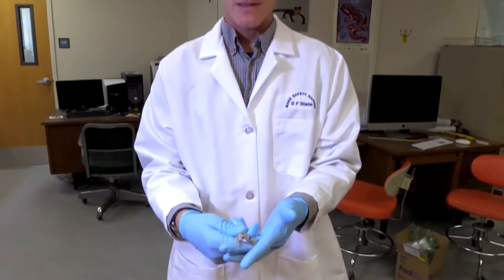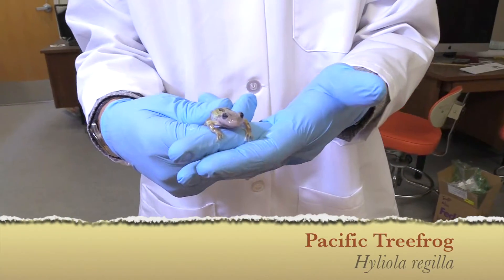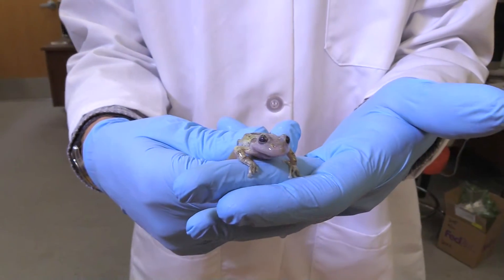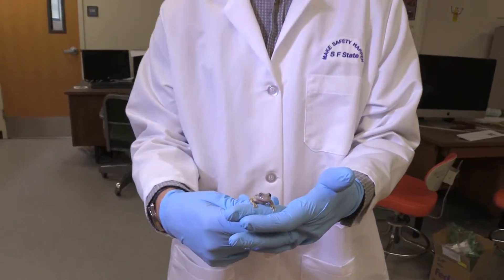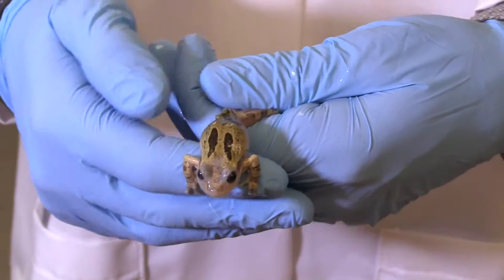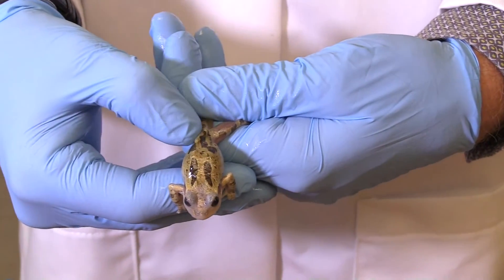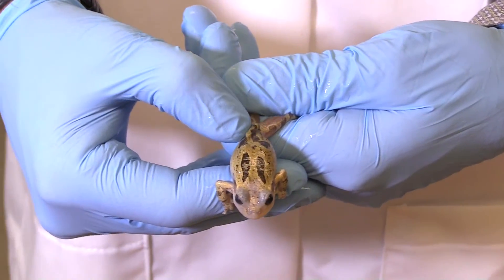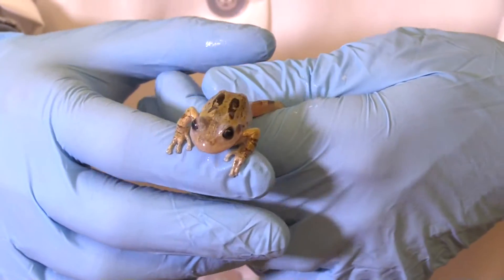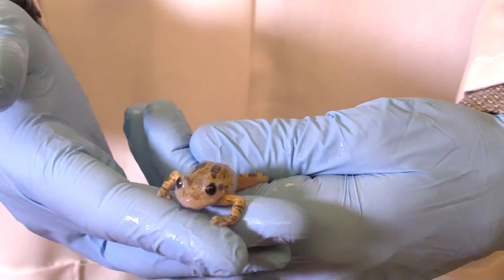I'm going to collect a chytrid swab from this frog right here. This is Hyliola regilla, the Pacific chorus frog or Pacific tree frog. It's very common here in California and is one of the species that is mostly resistant to the chytrid fungus, which has been devastating to amphibians around the world. This guy has a pit tag, which is a microchip — it's about the size of a grain of rice and is a way that we can individually identify amphibians, used in both lab and field studies.